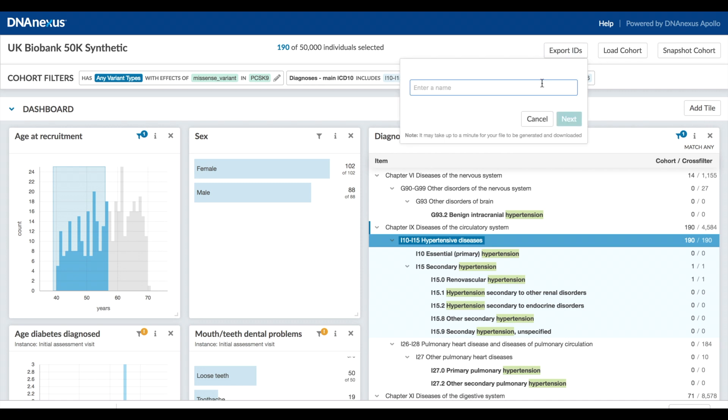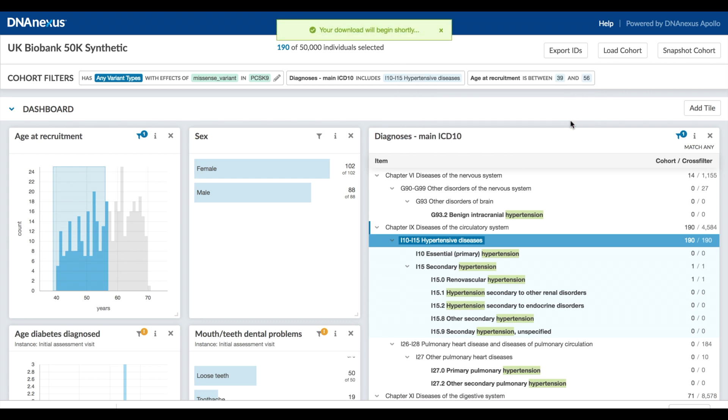Or as another option, simply export the sample IDs corresponding to your cohort. Where you go from there is entirely up to you.